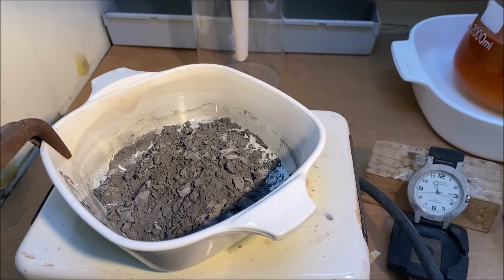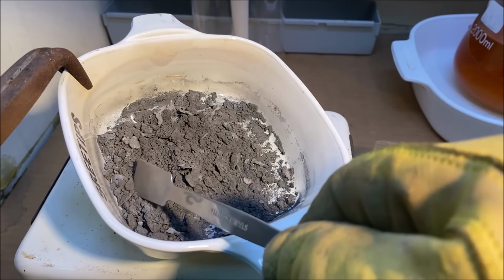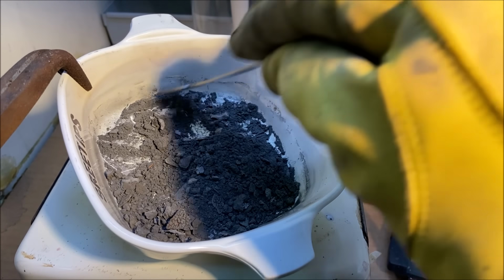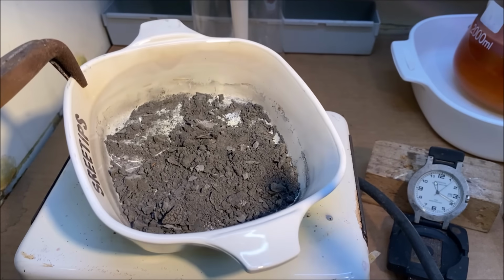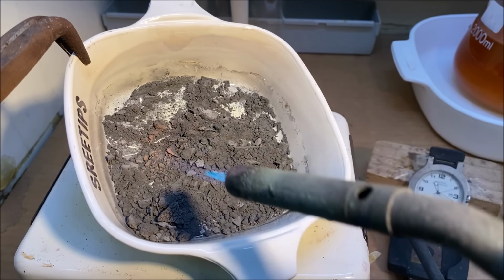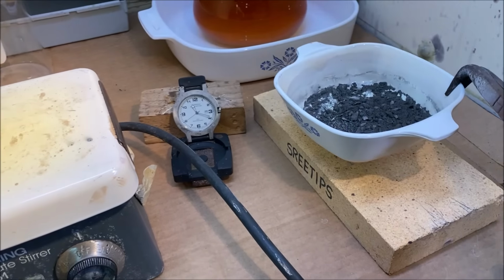All right, the rest of this looks superb. That's platinum sponge. It's not going to be pure. It'll be impure. It's going to have other platinum group metals in it. There's one more little spot right there. Got that out of there. So now what we'll do is we'll turn this off, and let's pull this down over here and let this cool off.